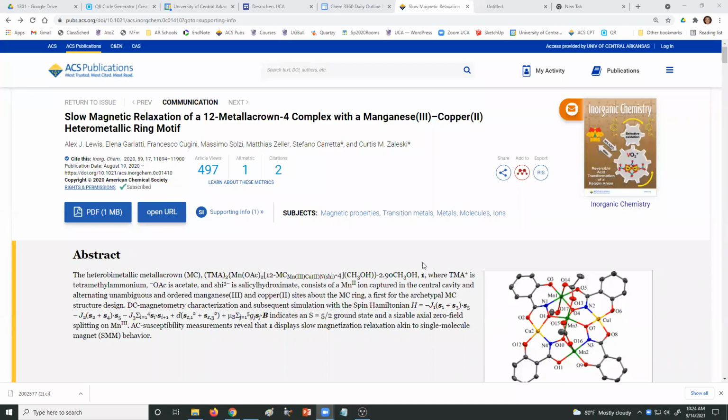All right, here I'm going to show you some of the steps of getting your structure from the journal article and then opening it in Mercury and some of the manipulations you can do in Mercury. Once you've found the article that you want, most journals, this is Inorganic Chemistry, but they all do this. Most journals have what's called something like supporting information.